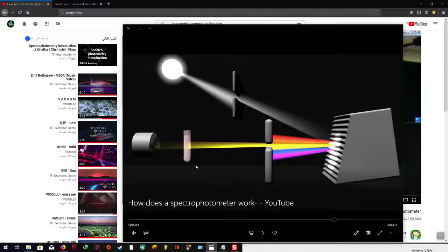So if we zero with the distilled water, there are still many components of the blood or the plasma that will not be ignored and will give a rise in absorption, as a plus to the absorption by the electrolyte we want to measure, because there are many elements that have the same wavelength, for example.